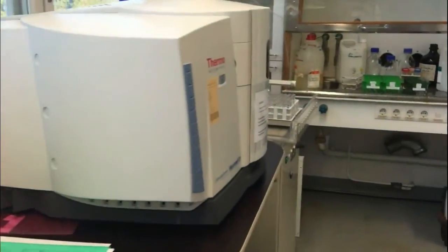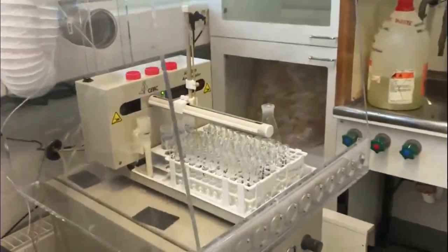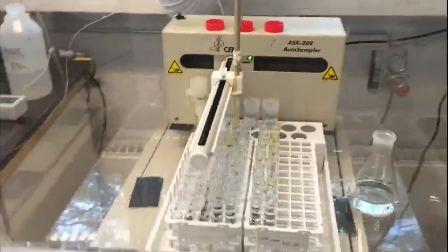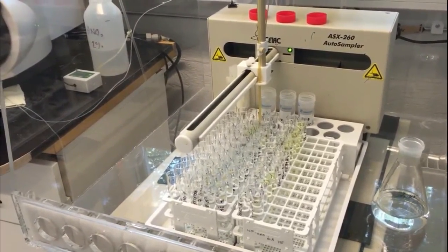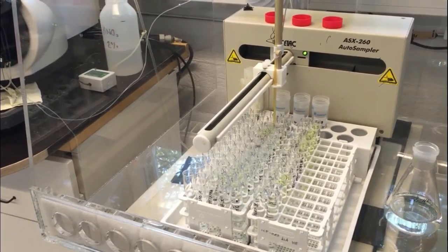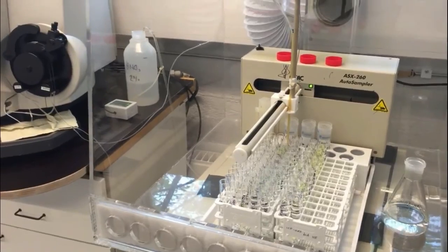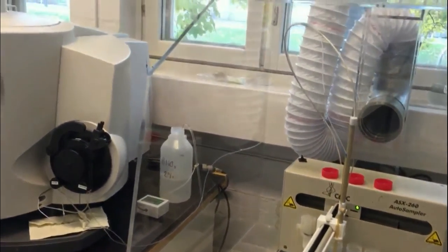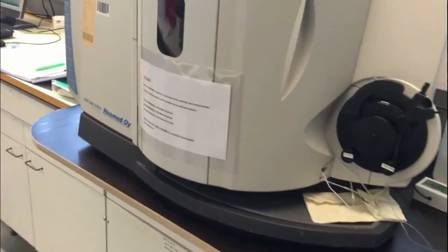Here, this is the main ICP-OES part of the device. Here we have the sampler. As you can see, samples are in test tubes. They're extracted and filtered, and there is a pump in the sampler which takes the sample through this pump to the nebulizer. And here it is, the nebulizer and the torch, which we cannot see actually.